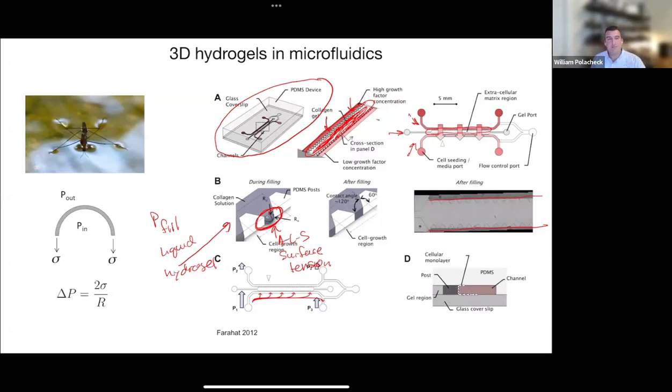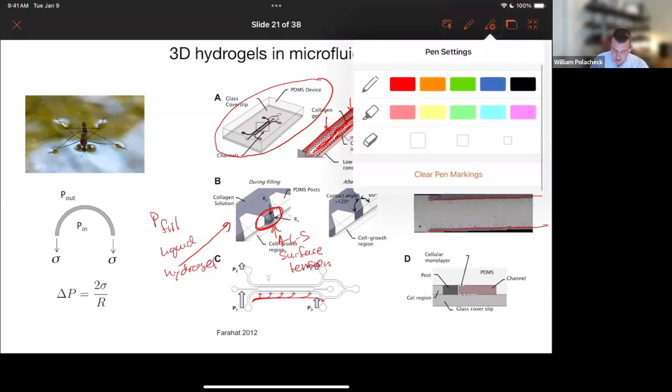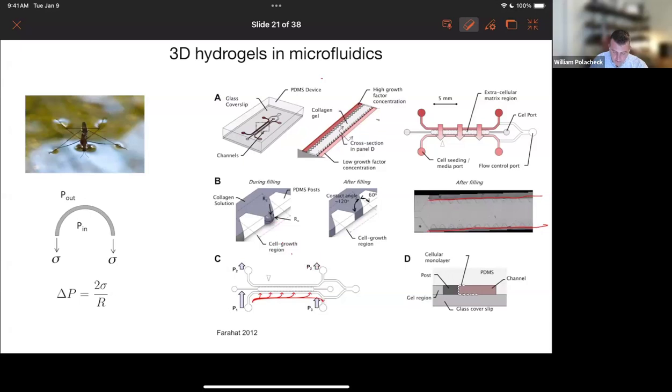Why are the pillars specifically trapezoidal? Like, why not rectangular or circular, if really the distance between the pillars is what matters? That's an awesome question. I should say that this is a little bit older work. It's kind of a good teaching example, but our lab has gone away from the trapezoids. So if this is relevant to your research, please reach out and I can explain why.